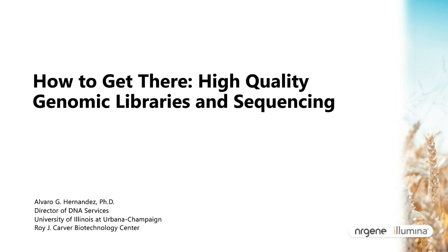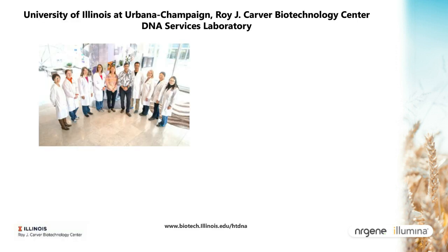I'm first going to give you an overview of our sequencing facility, and then I will talk about the unique expertise that we bring to the de novo assembly and how our partnership with NRGene and with Illumina has enabled high-quality assemblies of over 100 genomes. Our facility is an academic facility, but our capabilities are available to other institutions, and we routinely partner with other academic and private institutions from all over the United States and also from other countries.